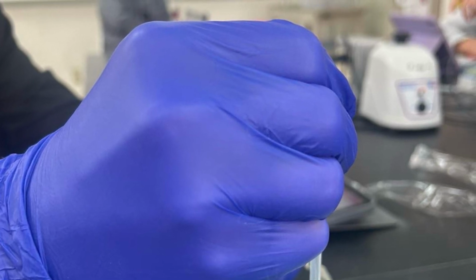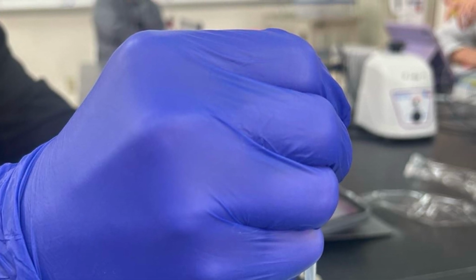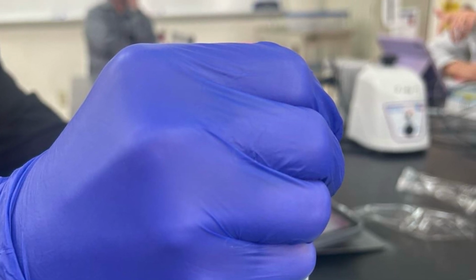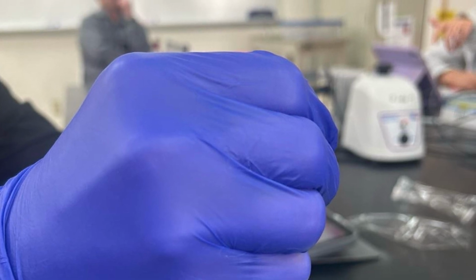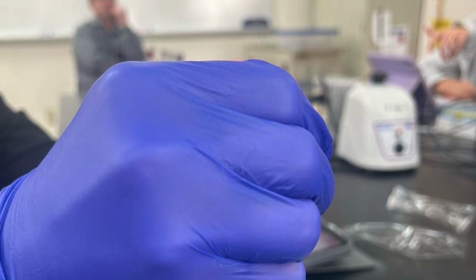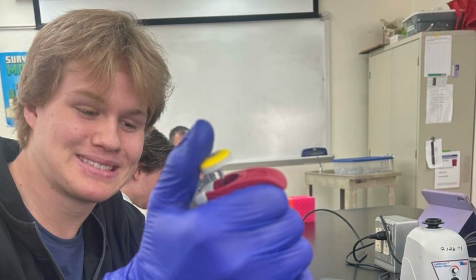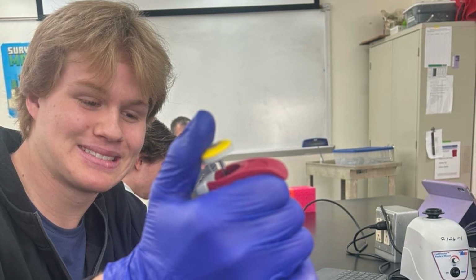E. coli is a common, fast-growing bacterium used in lab studies, and ampicillin is a beta-lactam antibiotic that kills bacteria by interfering with their ability to form cell walls. Some E. coli carry a gene that makes them resistant, usually on a plasmid, which encodes an enzyme called beta-lactamase. This enzyme breaks down ampicillin before it can harm the bacteria. So in our experiment, these resistant strains had a survival advantage in environments containing ampicillin.